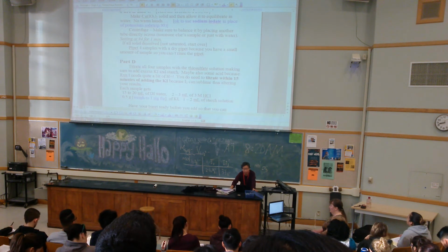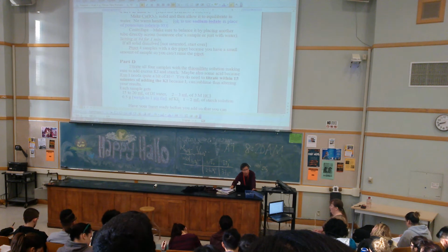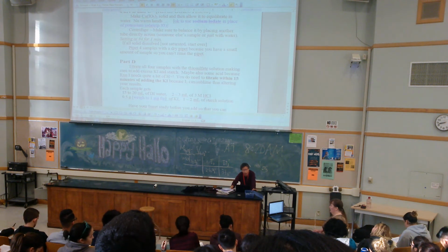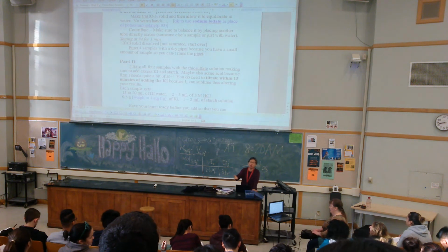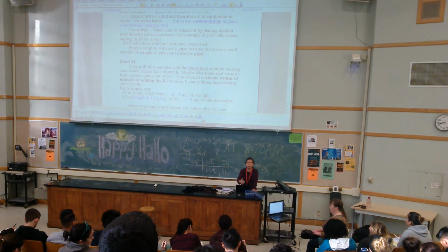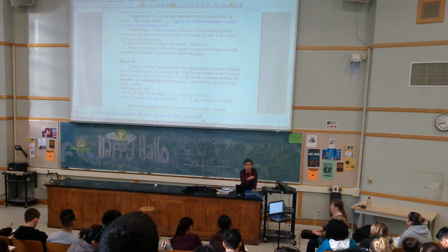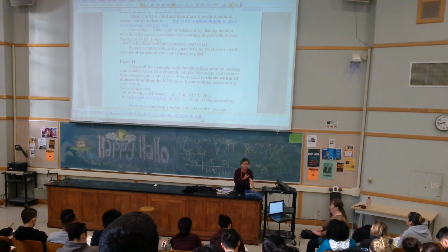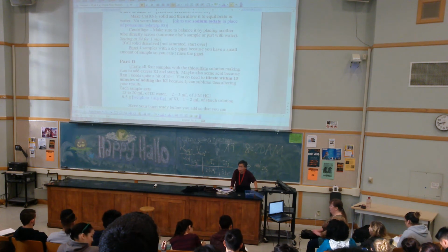So each sample gets, this is in your manual, potassium iodide added to it. You can weigh it, about 0.5 grams, roughly, on the top-loading balance. It means you don't have to go to the balance room to weigh. You following me? You can use the balance in the back, because we're throwing in excess KI anyway. So about 0.5 is good, but you need to weigh it, all right?